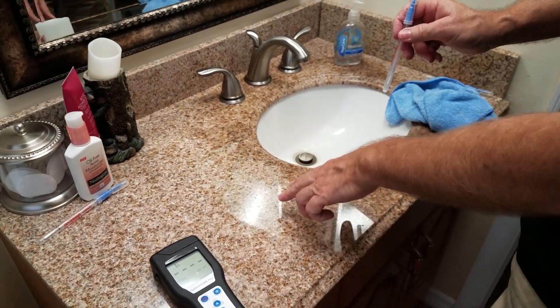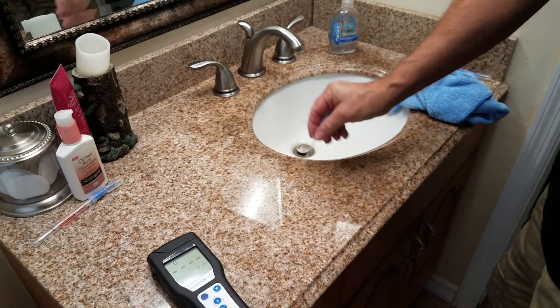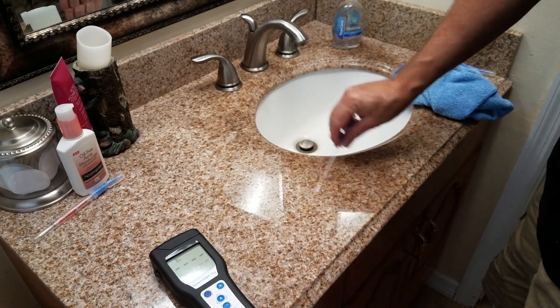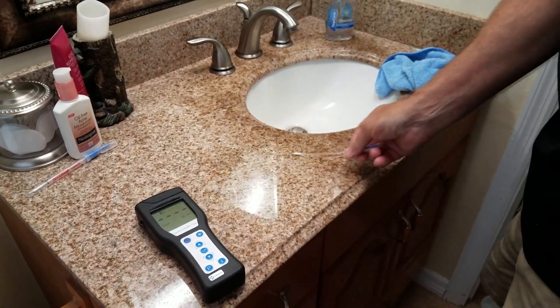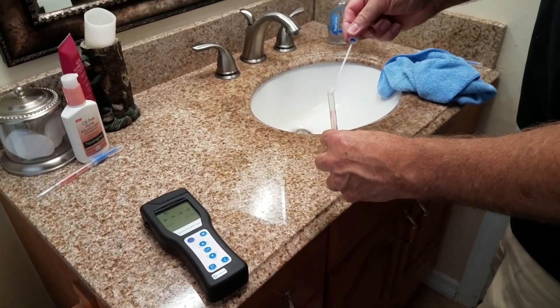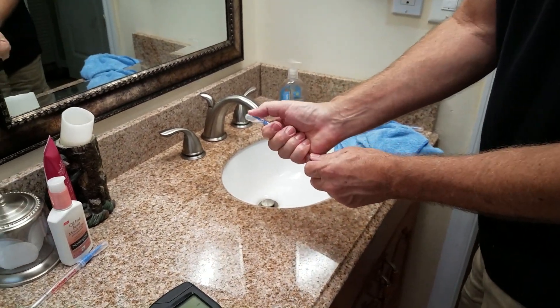We cleaned this with our cleaning product and put the Zuno on it, which is a product that as it sits on the surface, it keeps killing germs and it stays on the surface unless you wear it off or rub it off. Let's see what the reading is where Zuno has already dried.